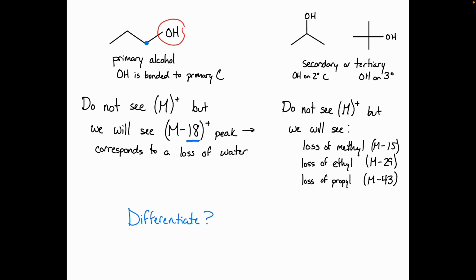Alcohols are the pain in the butt, right? It's awesome if we have the M and the M plus 1. Done, right? If it's going to be a little bit more complicated, though, we've got to get in the weeds there. And again, alcohols are going to be the one that we see most often with this.